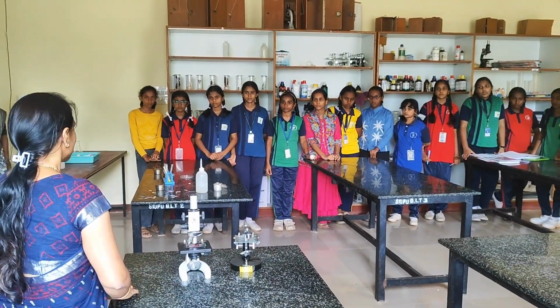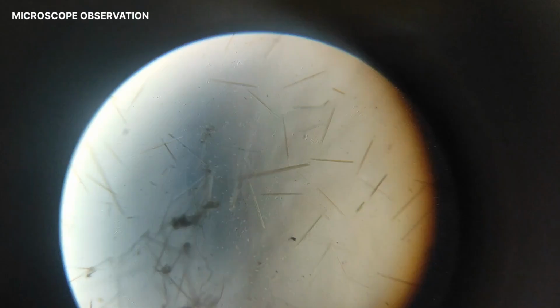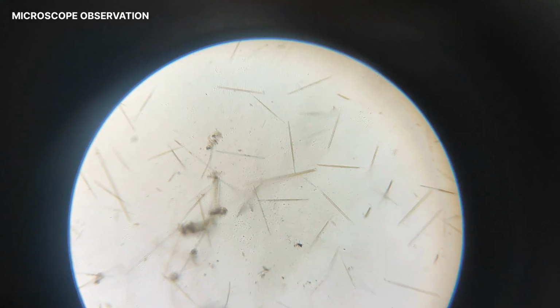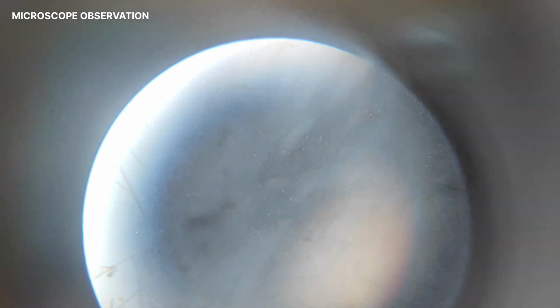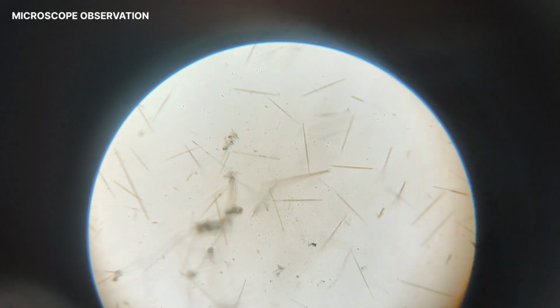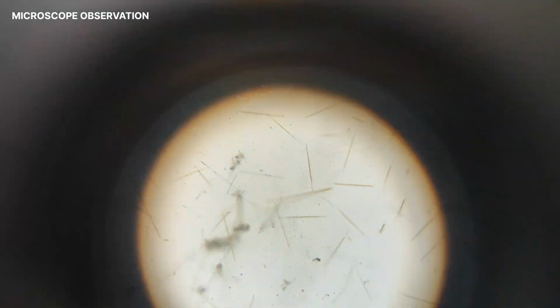Yes? Stain. And in 5 days we can observe cheek cells. Cheek cells, onion, mitosis, meiosis, anaphase, very beautiful.